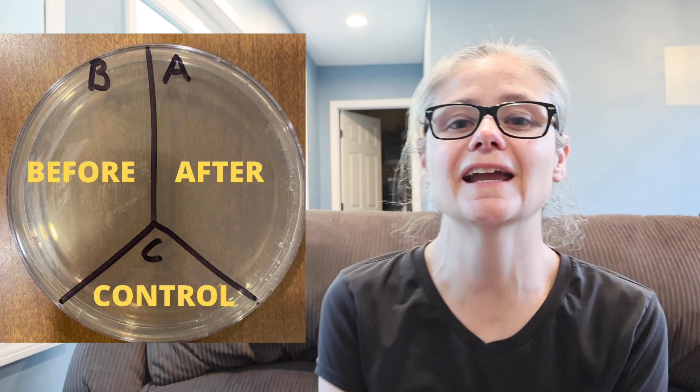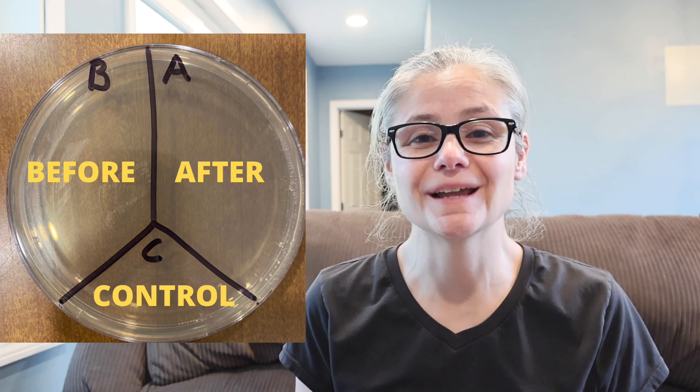In order to test how well this UV lamp works, I'm going to take a petri dish and label them A, B, and C. I'll take some sterile swabs and swab areas around my home like my kitchen sink, bathroom sink, and toilet rim. I'll place those samples in the section labeled B for before. Then I will use the UV lamp, swab the areas again, and place those samples in the section labeled A for after. C is my control — nothing goes there. This way we'll be able to see how much bacteria is on a surface before and after using the wand.